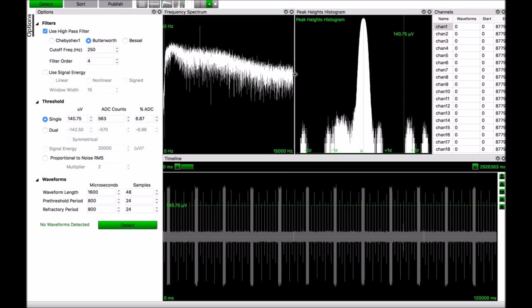So with that workflow of BOSS out of the way, and a demonstration of how easily flexible the layout is and how quickly we can load data from large files, let's go ahead and jump into the actual options window and work through this detection step.